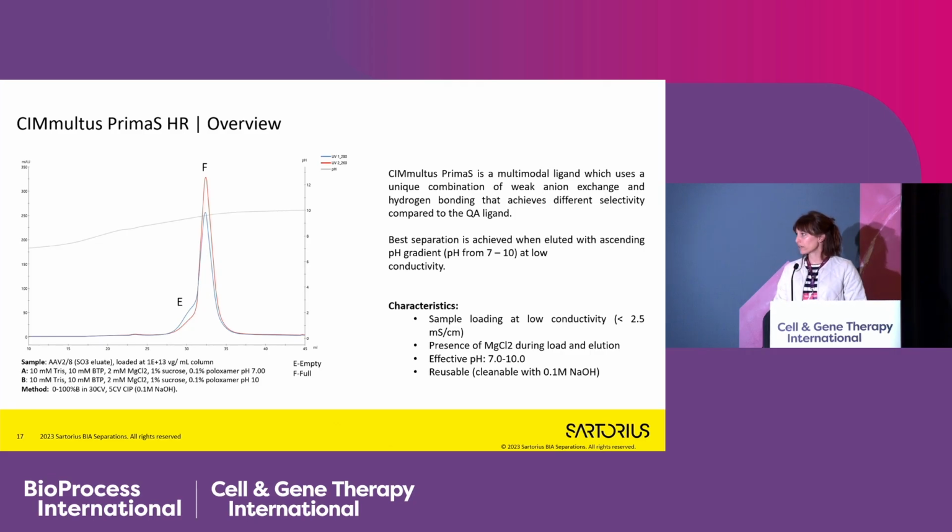So the characteristics for, let's say, perfect run would be that we are loading the sample at low conductivity, 2.5 millisiemens per centimeter or lower. We can add magnesium chloride during loading and elution. The effective pH working range is from 7 to 10, and also this column is reusable. You can clean it with 0.1 molar sodium hydroxide.